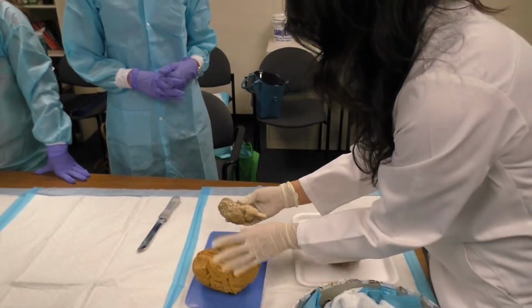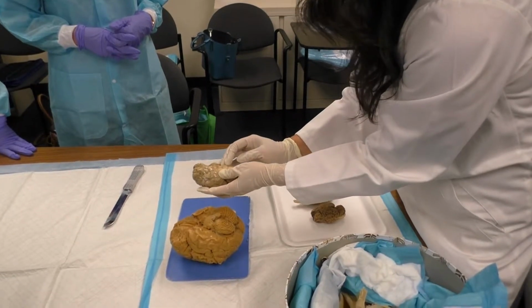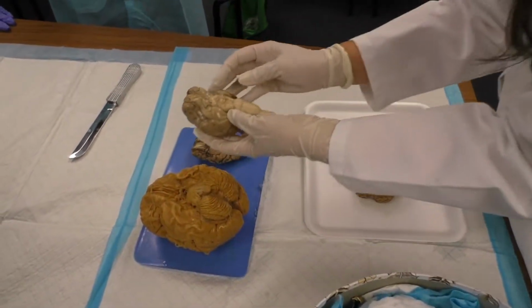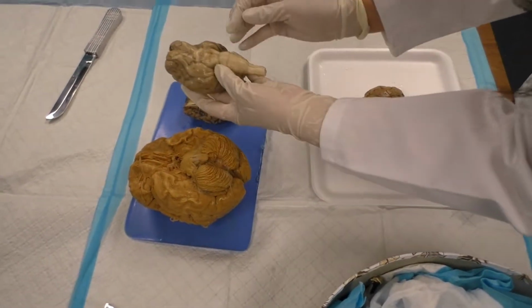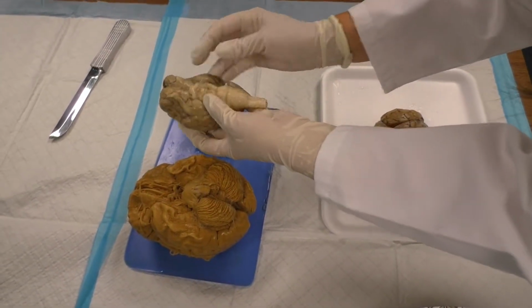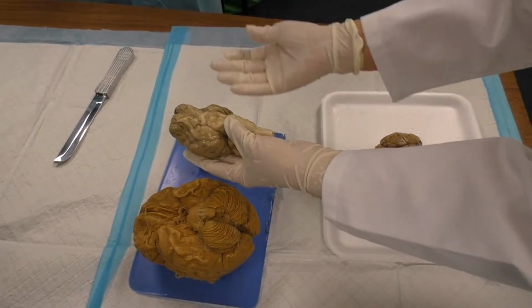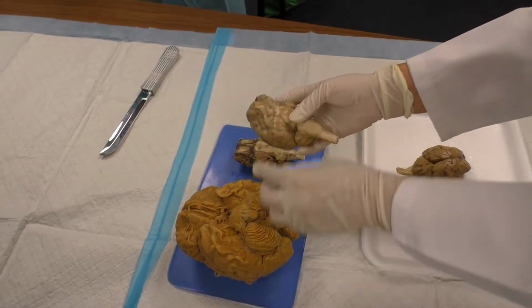Besides general organization, the other things that are really similar and fun to go over in class are the cranial nerves. So there are 12 sets of cranial nerves. And the cranial nerves differ from your regular spinal nerves because they're inserting in the brainstem or midbrain, or it goes directly into the cortex. So they're specialized nerves, starting with olfactory. They cover the special senses, head and neck, sensory and motor systems, but you can follow them down.